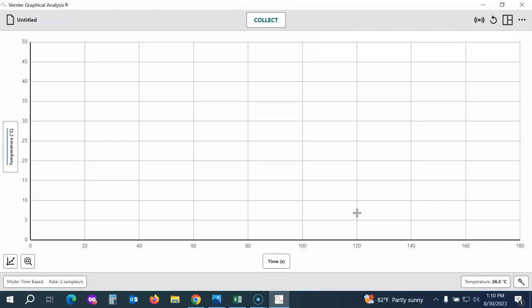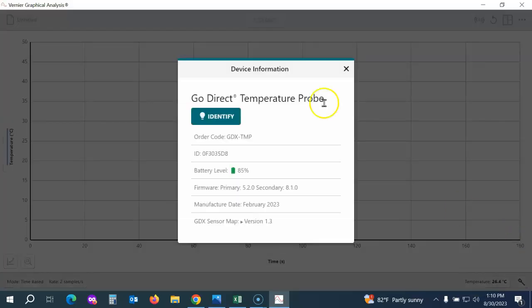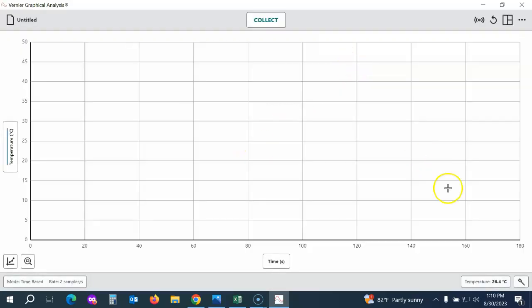That takes me to the Graphical Analysis working screen. In the lower right corner, it'll tell you what kind of sensor you're connected to and the live reading. If you click into that, you can change the units you're using to collect data and check the battery level. For some probes, if they need to be zeroed or calibrated, that's also how you would do that. The lab documents will explain if that step needs to be taken.